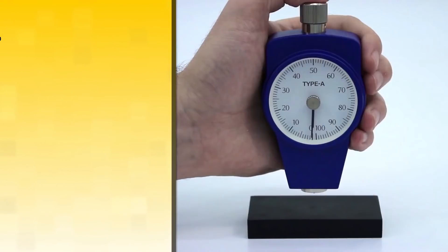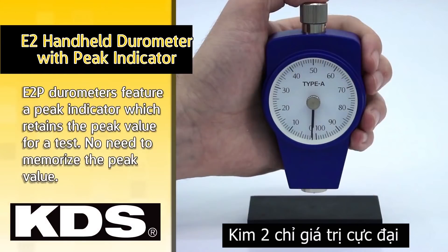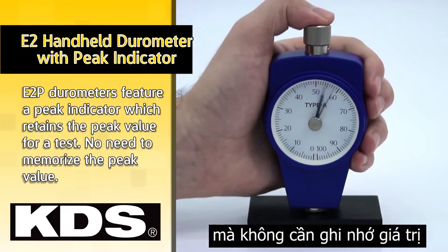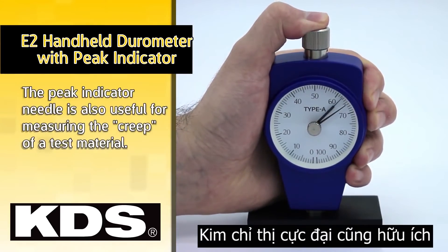E2P durometers feature a peak indicator, which retains the peak value for a test. No need to memorize the peak value. The peak indicator needle is also useful for measuring the creep of a test material.